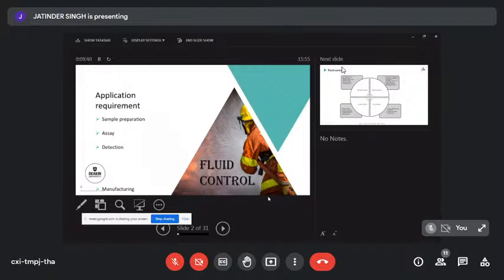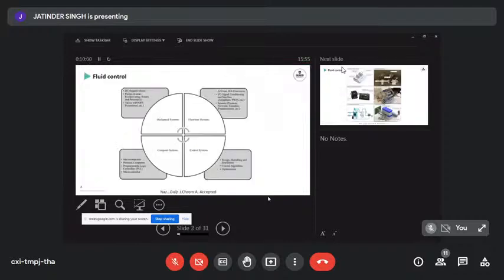They've gone through a couple of design iterations to aid manufacturability, and together it makes a really nice story to start realizing what to think of when you start a project, to make sure it gets as close as possible to commercialization in the end. But first we'll be talking about some fluidic control elements. We've just had a review accepted on how you can achieve fluidic control, really from an electrical engineering perspective.